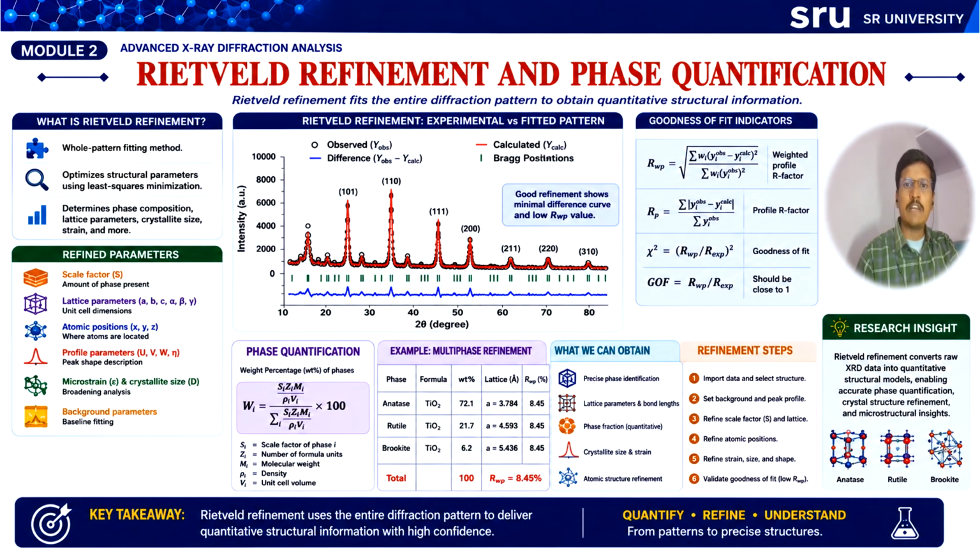The phase quantification equation shown here allows us to estimate the weight percent of each phase using the scale factor obtained during the refinement.